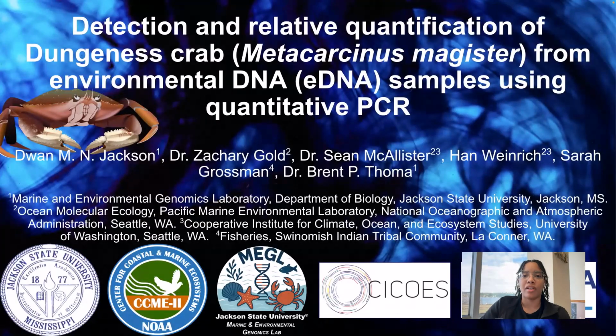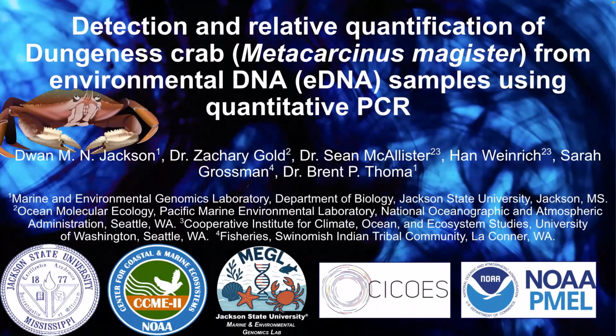And again, I'm going to be talking about my project, the detection and relative quantification of Dungeness crabs or Metacarcinus magister from environmental DNA using quantitative PCR. And this was done during my NERTO here at NOAA's PMEL with the Ocean Molecular Ecology Group. I'm going to start and explain a little bit about the background about the species, about why Dungeness crab is our particular species of interest.